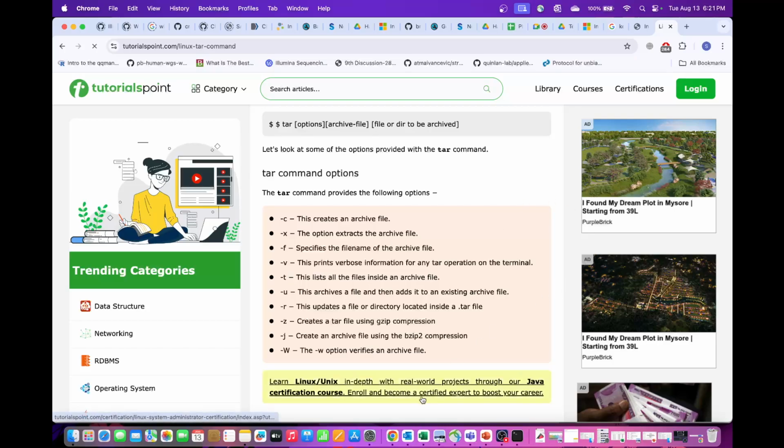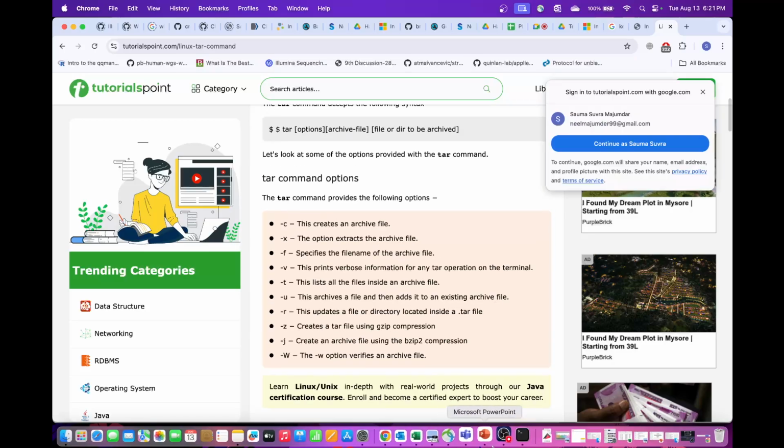Okay. So tar is actually another type of compression that we see. Thank you for reminding me. I actually skipped this one. But tar is one of the types of compression that you'll quite frequently see for different kinds of software. Specifically, they are compressed as tar files, which you need to uncompress.